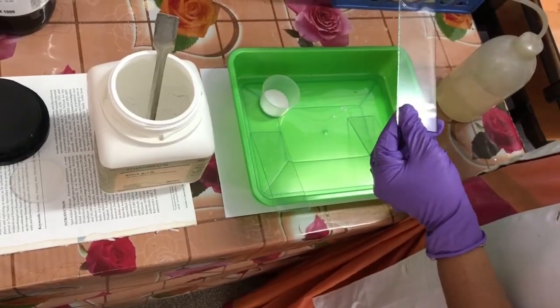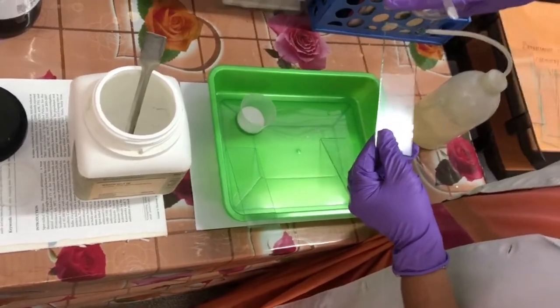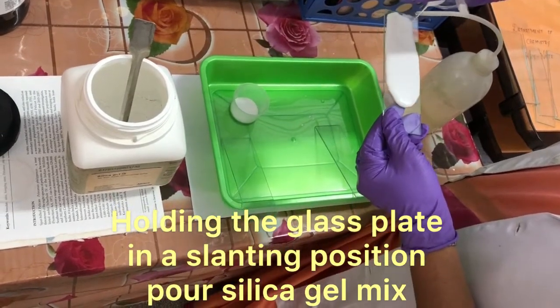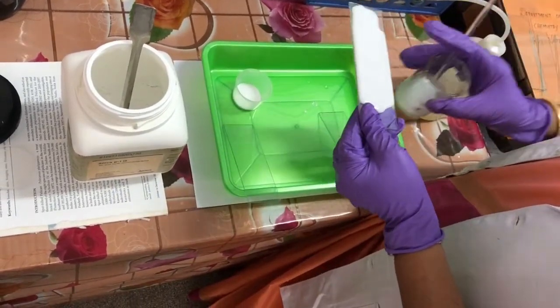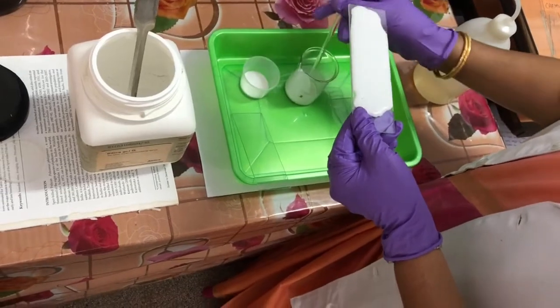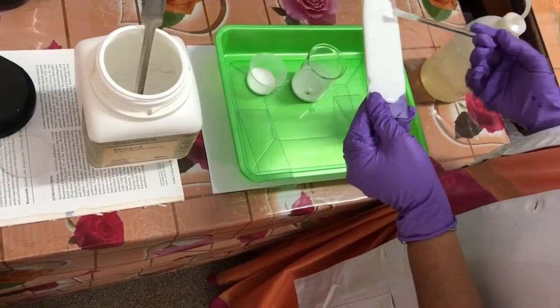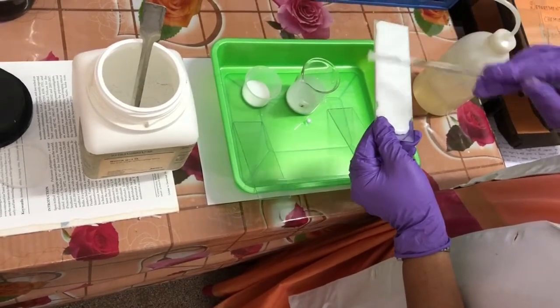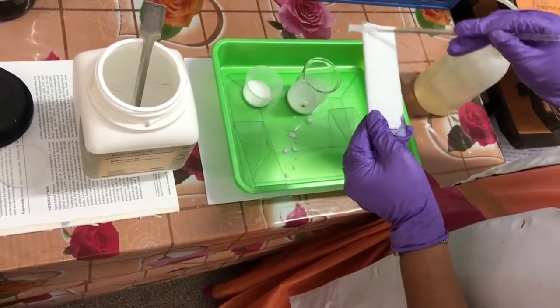Keep the plate on the tray, hold it in a slanting position, and then pour the silica gel. It will run down the plate. Once it reaches the bottom, make the plate straight, and adjust on the sides. Your glass rod should not touch the center.